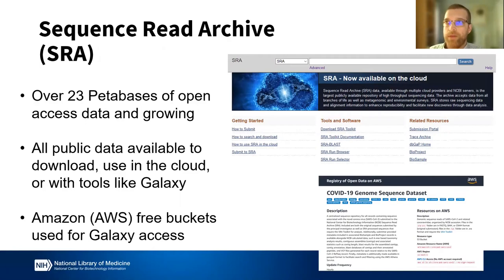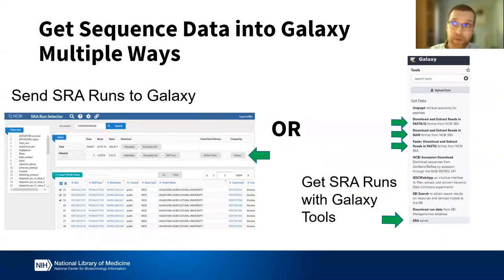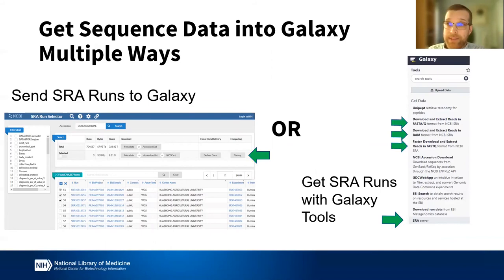Thanks, Nuala. For any of you that are unfamiliar with the Sequence Read Archive, we have 23 petabases of open access data, and that number is constantly growing. All of it is available for download either directly from NCBI or within commercial cloud providers Amazon and Google. Galaxy has been using the Amazon cloud resource to provide data to users since about February of this year, and it has shown improvements in speed and reliability. You can get SRA data into Galaxy via a button in the computing column on the upper right-hand side of the SRA run selector, or from within the Galaxy tool itself using 'Get Data' to download in specific formats or search for accessions.